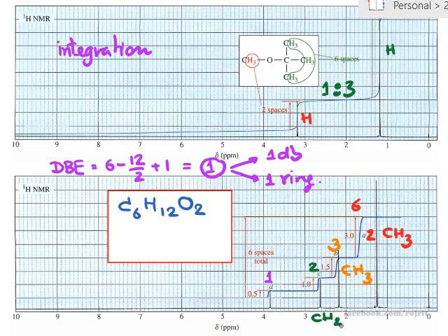Okay. And what else? So we are now using 2 carbons in red color, 1 carbon in yellow color, 1 carbon in green color. So you have 4 carbons already, right? So this one should be maybe carbon or maybe OH, right? Because you have only one hydrogen atom. It may be OH or it may be carbon with 1 hydrogen atom.